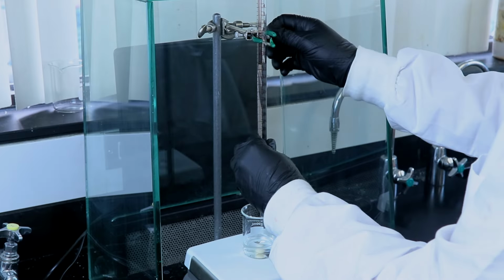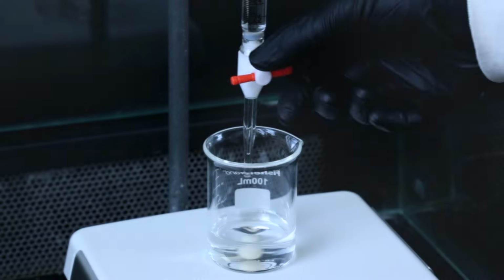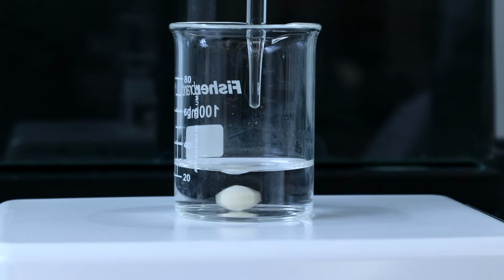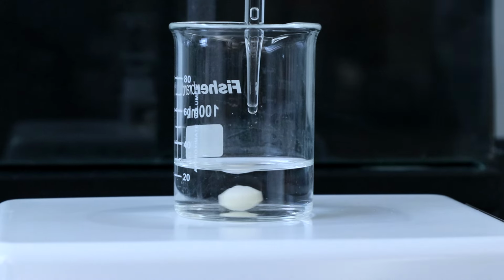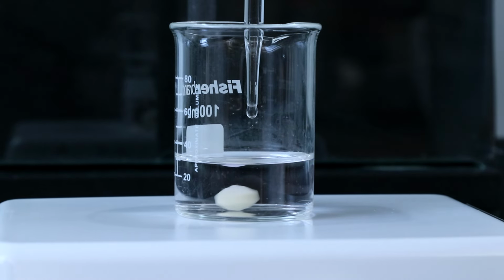I'll set up the burette above the beaker with the dissolved unknown acid, carefully opening the stopper so that the base can start coming out slowly dropwise. And initially there's no pink color as the droplets hit the aqueous solution, but eventually some pink color starts to linger as the base is added, so I'll want to slow things down a little bit as that starts to happen.